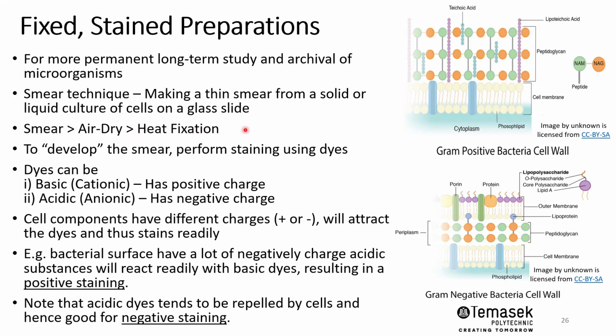we allow it to air dry for about 5-10 minutes. Once it's completely dry, we will do a heat fixation. Heat fixation kills the specimen and then secures the specimen to the slide. It also aims to preserve the cellular components with minimal distortion.